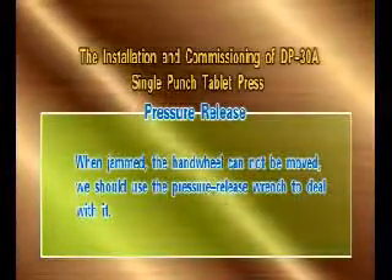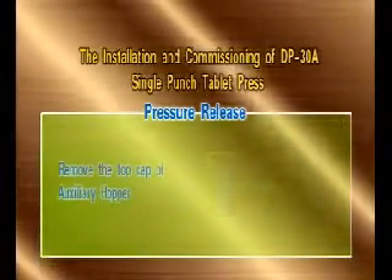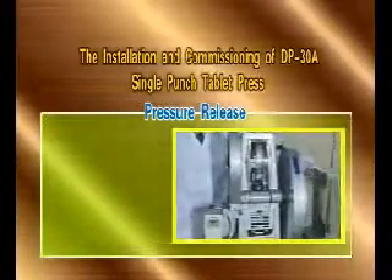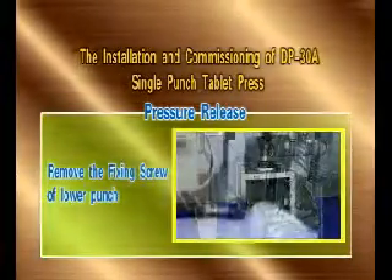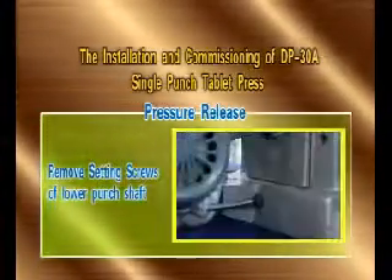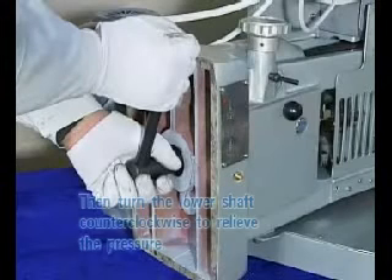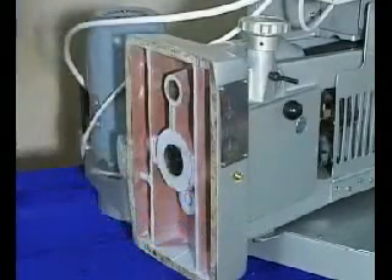Pressure release. When jammed, the hand wheel cannot be moved. Use the pressure release wrench to deal with it. Remove the top cap of the auxiliary hopper, cover, and filling mechanism. Remove the fixing screw of the lower punch and the setting screws of the lower punch shaft, then incline the machine. Insert the pressure release wrench into the square hole at the bottom of the lower shaft and sleeve it. Turn the lower shaft counter-clockwise to relieve the pressure. After taking the tablets out, turn the lower shaft back to its original position and reassemble the setting screw. Then re-adjust the machine.